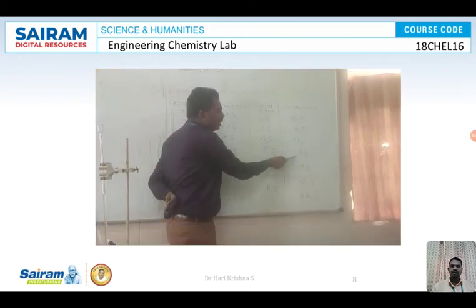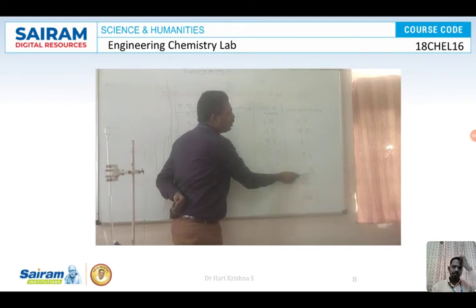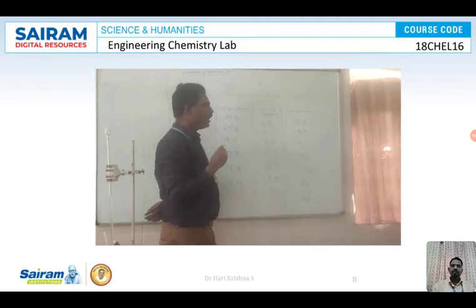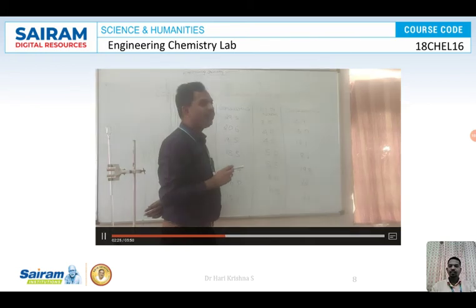The readings were increasing in 1.0 differences, but here it increases by more than 1.0. When this happens, it is because of the increasing concentration of OH minus ion, because you know that conductance is directly proportional to the mobility of ions.